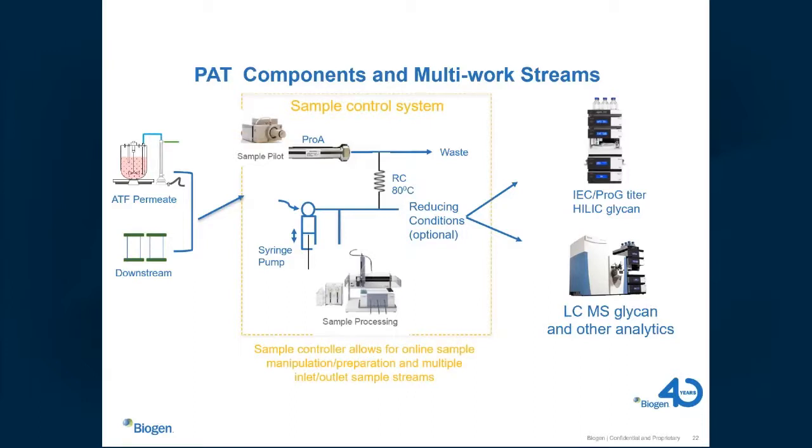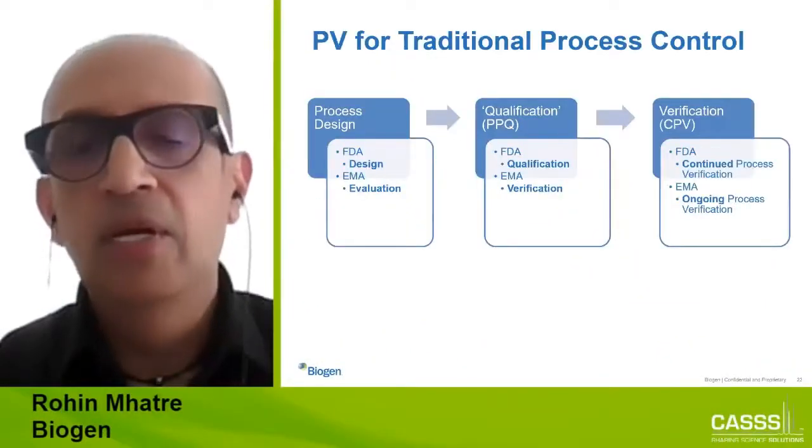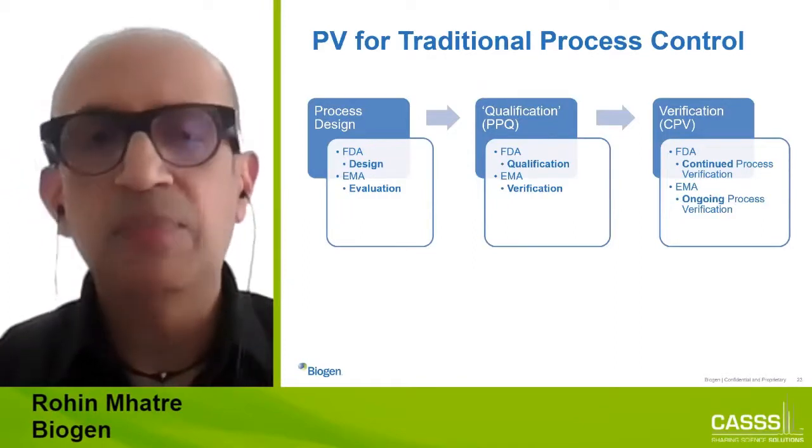But the way we've approached it is looking at all the sophisticated techniques we have to understand what's happening in the reactor. And as I said earlier, this could be 2DLC, looking at glycan analysis, looking at intact mass, reduced, and so on. And this is just what we believe are the eventual benefits of PAT and how that helps in our operation. Okay. So some of the last couple of slides.